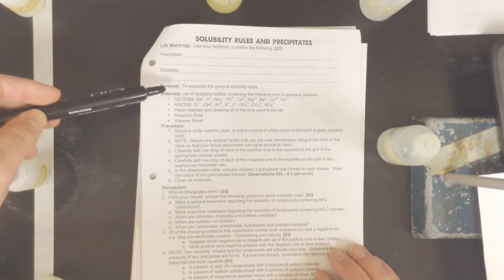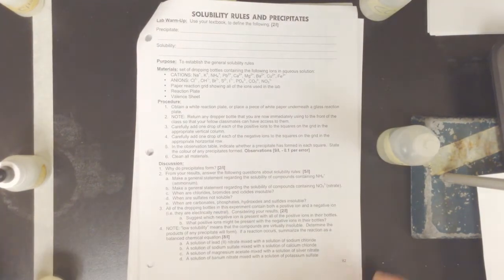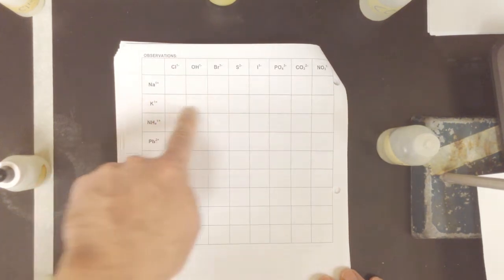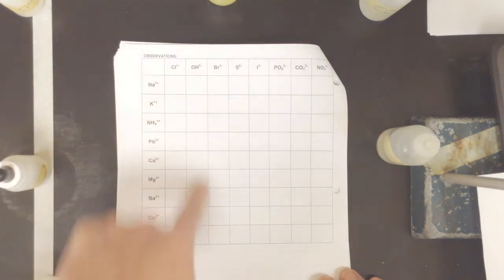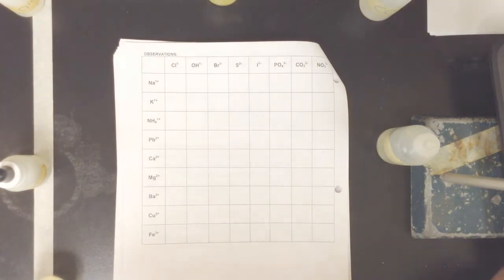Now, we've got a whole bunch of materials here. We've got a whole bunch of cations, and I'm going to be working through this, and you have some discussion questions to answer at the end. If we flip the sheet over, you'll see that there are two strategies to this lab. We can either start with cations and then add anions, working our way across this way, or we could start with an anion and insert all the different cations. I'm going to take the cation approach.